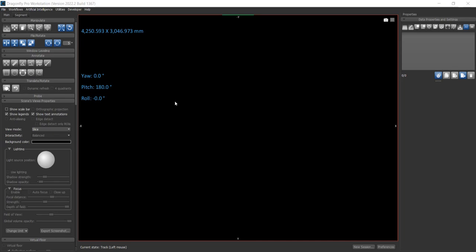Hello everyone, in this video I'm going to show you how to plot a histogram of any data in Dragonfly software. The version that I'm going to use today is 2022.2.